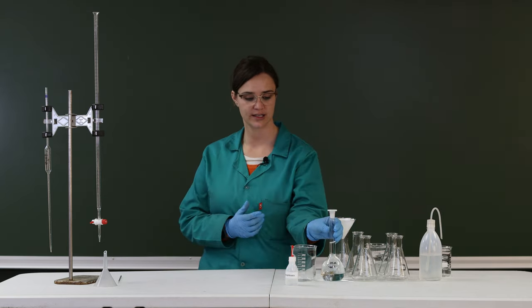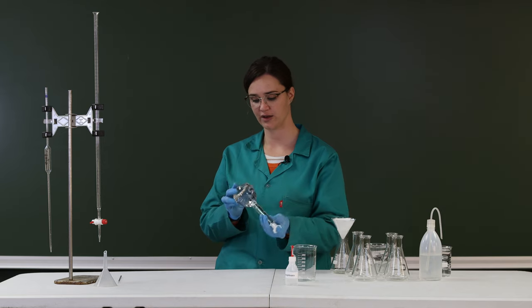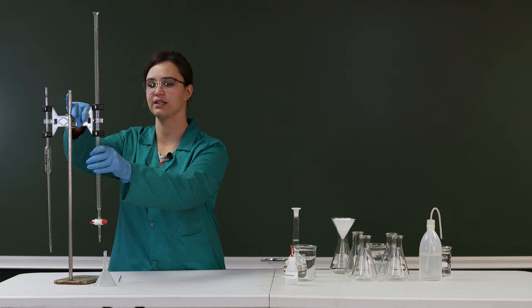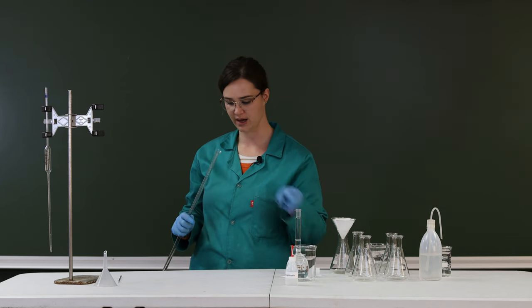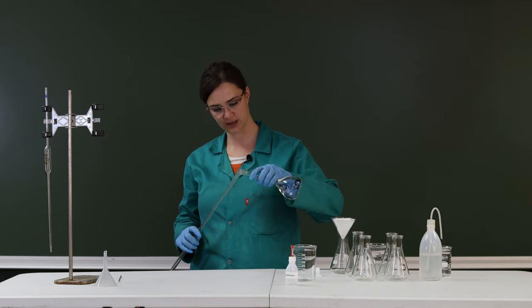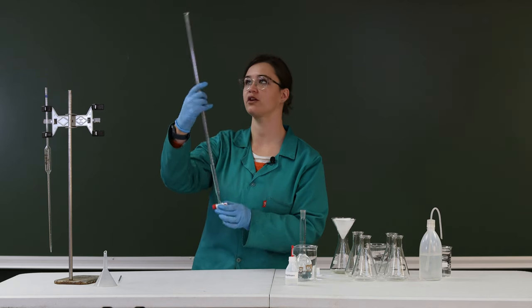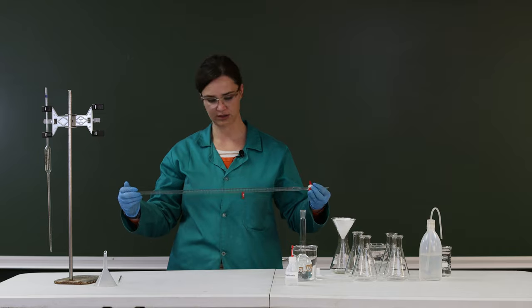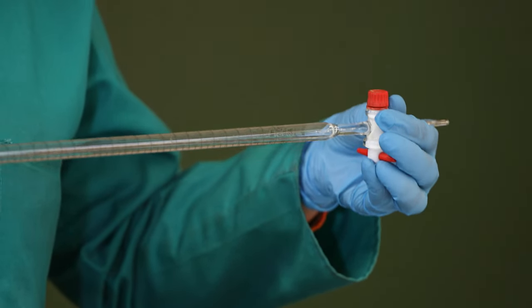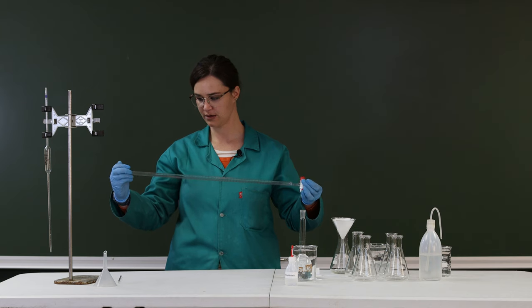We're going to be putting our potassium bitartrate into four different Erlenmeyer flasks and titrating it with the 0.05 molar sodium hydroxide. I'll quickly show you how to prepare a burette. This burette I've already rinsed with distilled water. You add a small amount of the sodium hydroxide — about 5 ml — making sure the tap is closed, and rinse the inside of the burette with the sodium hydroxide solution so that when we add our sodium hydroxide for the titration it doesn't get diluted by anything else in the burette. Then empty it into the waste beaker.